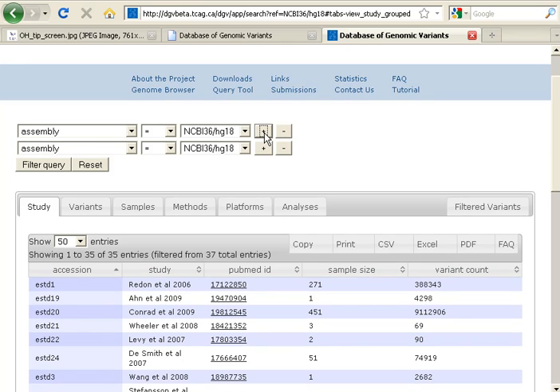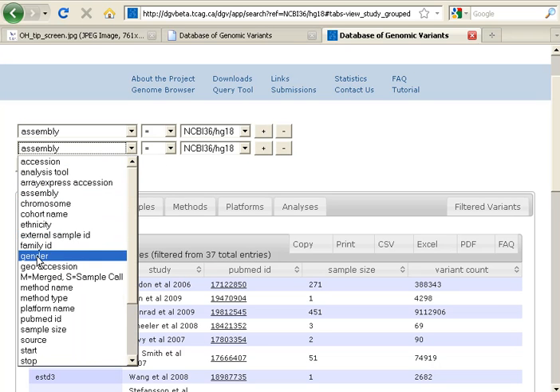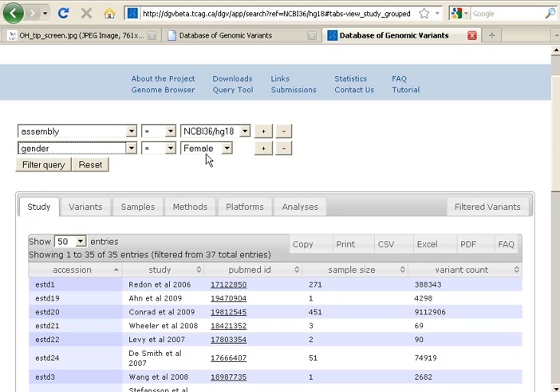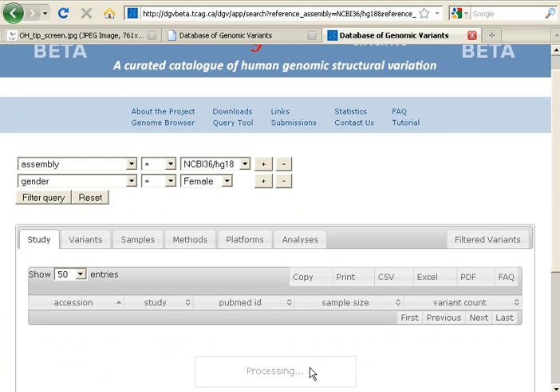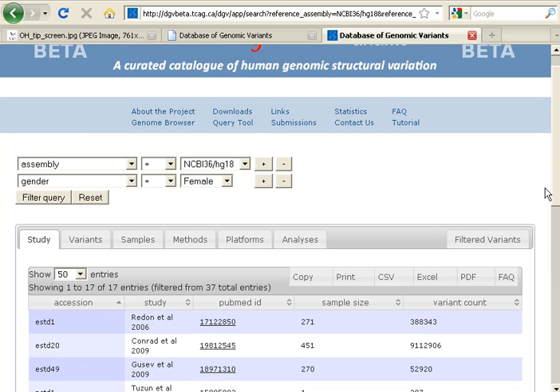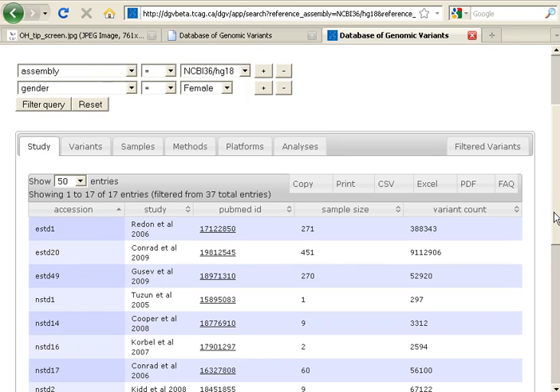I'm going to add a filter to our query, and for simplicity, I'm just going to add gender and use the default female. I can add as many filters as I want by clicking the plus, or I can remove some of my filters with the minus. To run my query, I'm going to click the Filter Query button. We'll get a message that our query is processing, and very quickly we'll get results. When the results load, they are organized according to various categories in these top tabs.